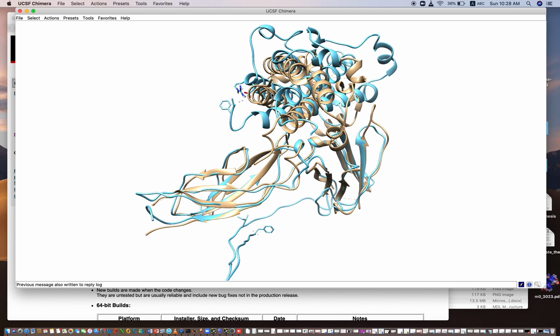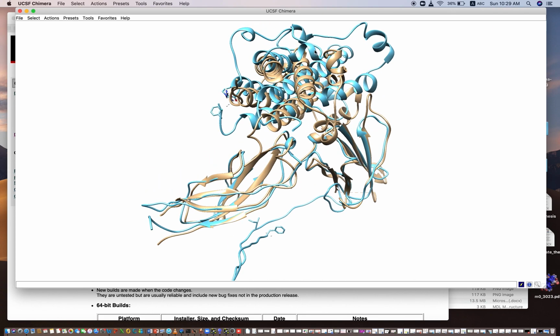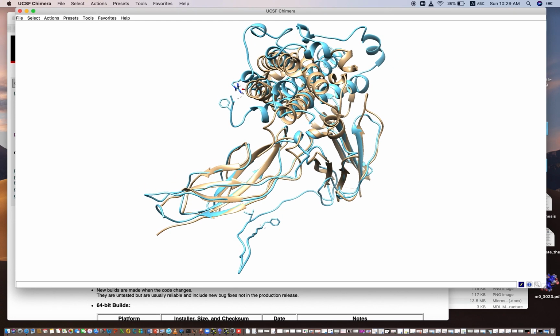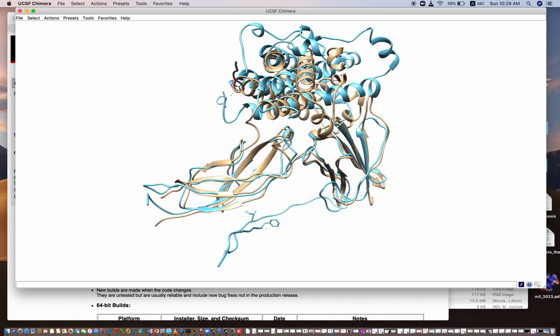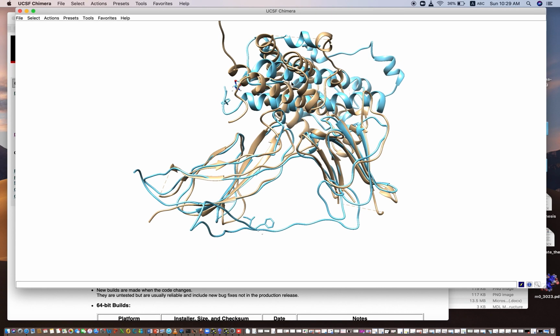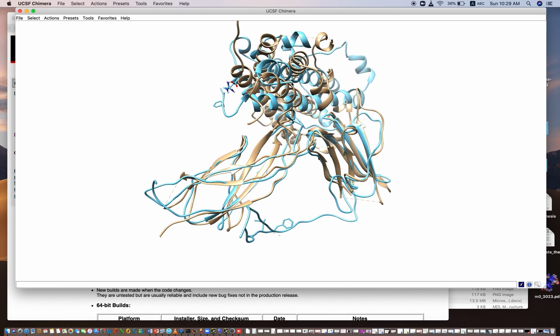This is the growth hormone in the helices. The hormone in cyan is from the buffalo, and the hormone in the brownish color is of the human, and they are almost similar to each other. Therefore we have docked it with the receptor as well.